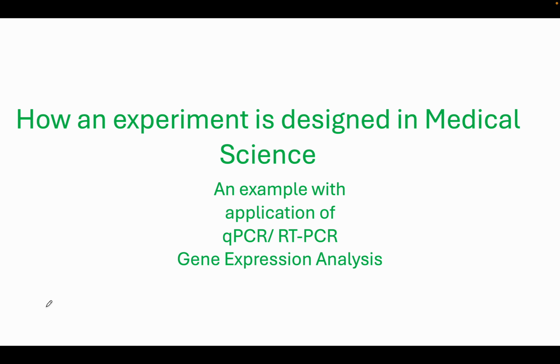Today I am talking about how an experiment is designed in medical science. I will use the application of quantitative PCR or RT-PCR for designing an experiment in medical science.